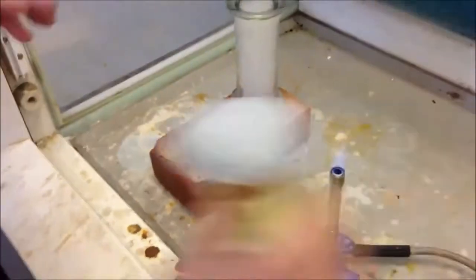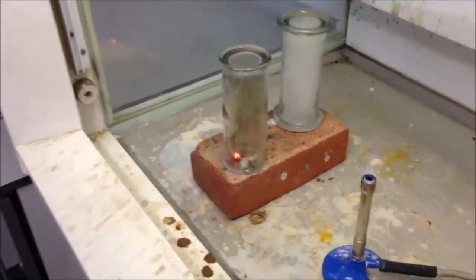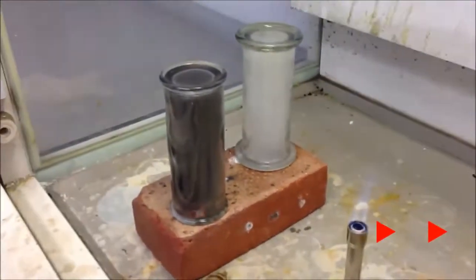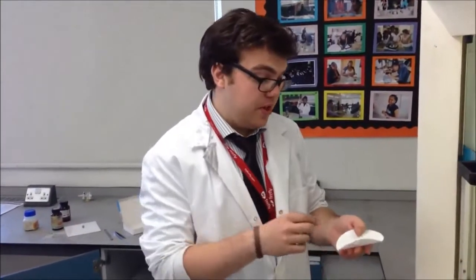Okay, I think we're ready to go. You'll notice that the sodium took longer to catch. It's because it's so reactive that the air reacts with it, forming a skin on top of sodium oxide.